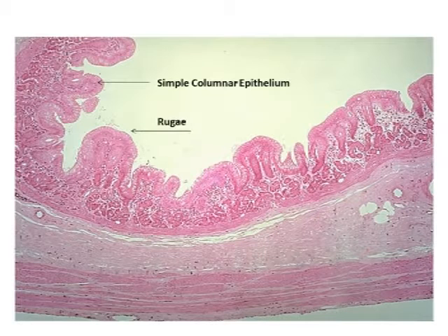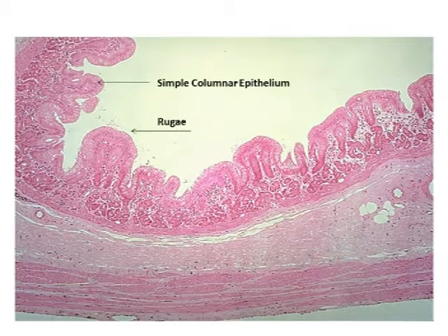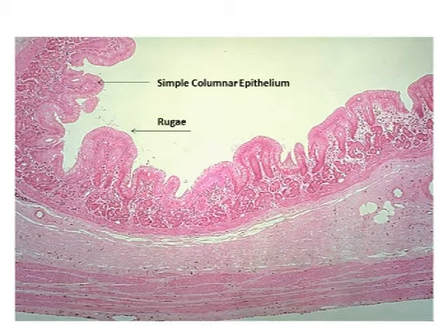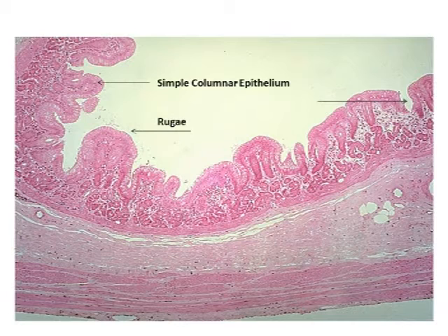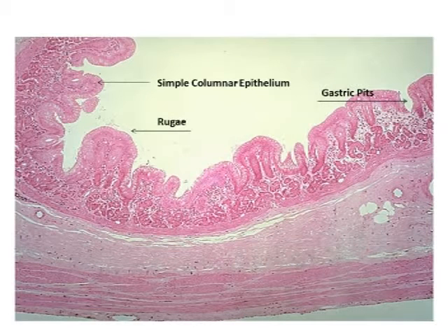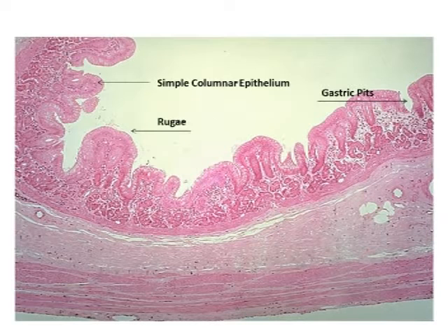Next is the simple columnar epithelium, which is the outer layer of the rugae. The gastric pits are the spaces between the rugae — the white space that you find between the rugae are called the gastric pits.